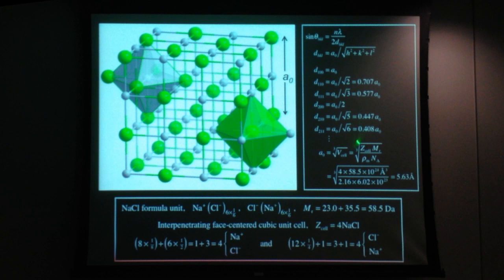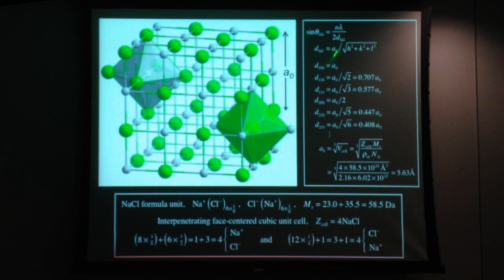So, in looking at the spectrum of scattered beams in the Bragg spectrometer, this relative sequence of the D spacings was known just from geometry and having at hand this D spacing formula. For the other crystal systems where we have unequal lattice translations, A, B, C, the D spacing equation gets a bit more complicated, but it always comes down to a straightforward, even if it's a little intricate, dependence of the D spacing on the lattice constants, up to 3 in general, A, B, C, which are, of course, conditioned by the interaxial angles, and then the indices.